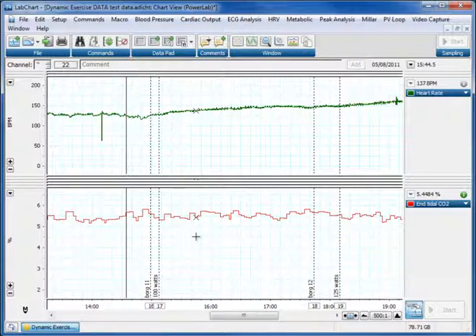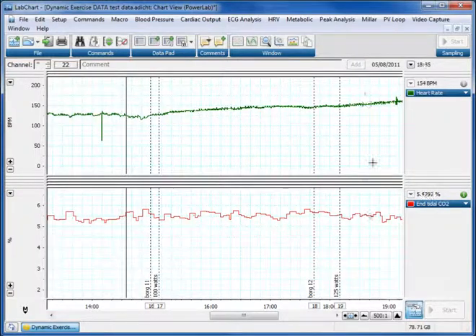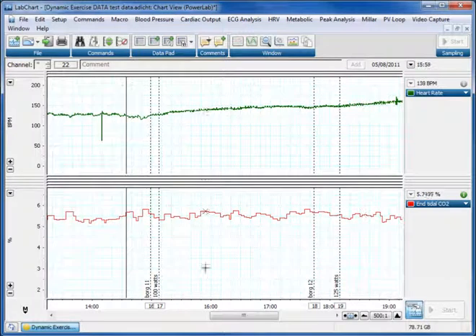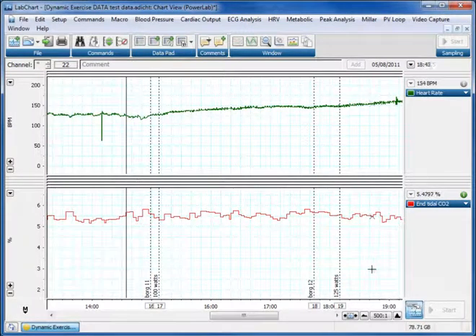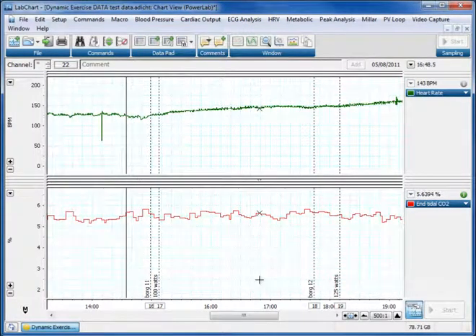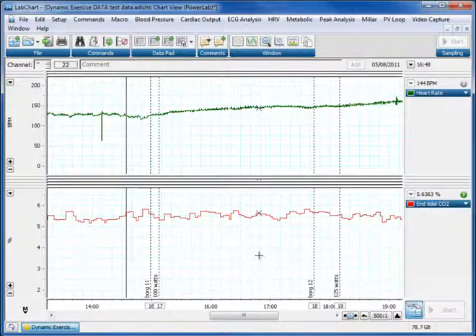So a lot of people do just do a screen grab by pressing Alt print screen on a computer, grabbing the screen, cropping off some of the bits they don't want, and pasting that into PowerPoint. Unfortunately that does generate fairly mucky pictures that aren't very easy to understand, they're very pixelated at screen resolution.